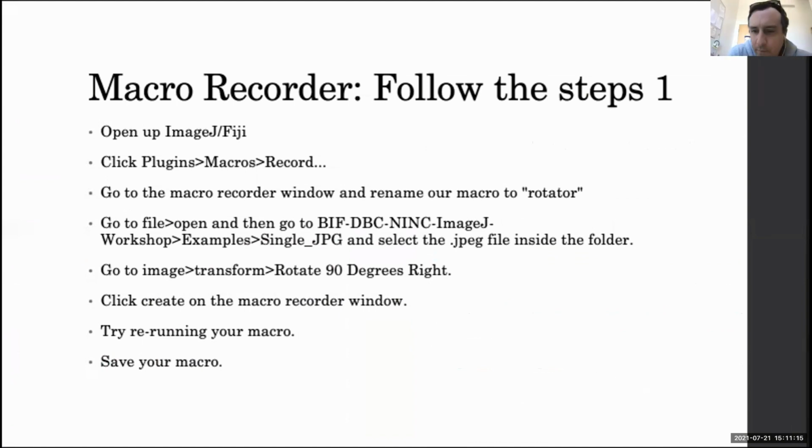Another question popped up about the utility of that command in the macro that opens the image. Yeah, so we're going to talk a bit more about the open command later. One reason I choose to include it in the macro is because you can always just edit it to open up a different one.